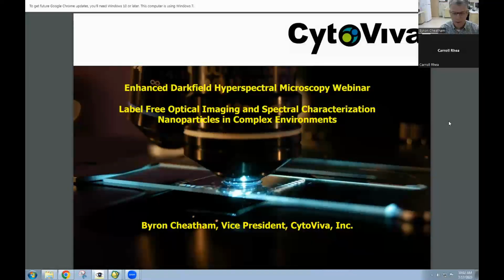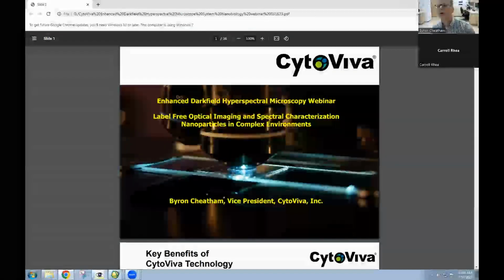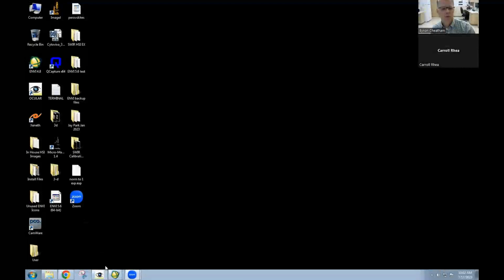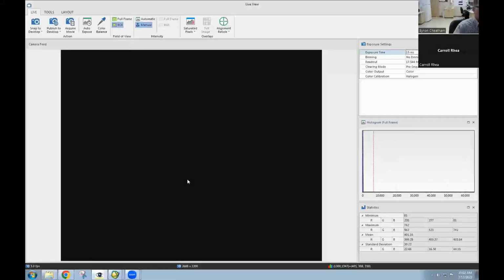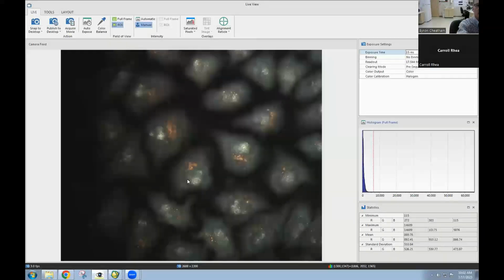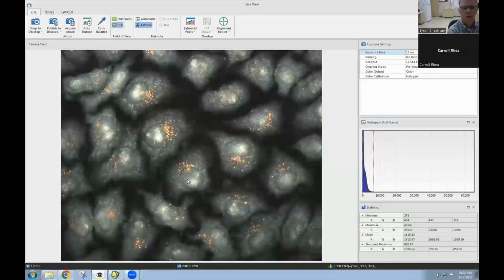So to get started, Carol, and everyone that's joining today, we're going to get out of the presentation mode here just for a second, and we're going to close that out, and we're going to see if our live preview screen for our live image opens. And yes, it is. So we actually have a live image this morning of nanoparticles in HeLa cells. I'm going to put these in a little bit better focus here so that we can see it. So you should be able to see my screen.